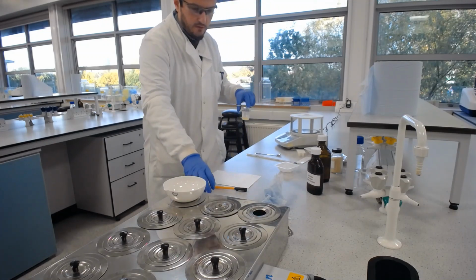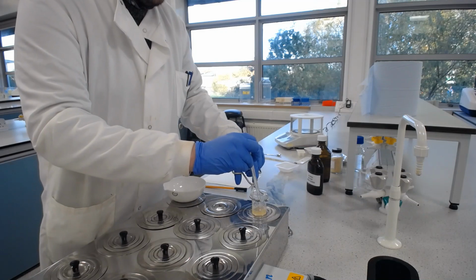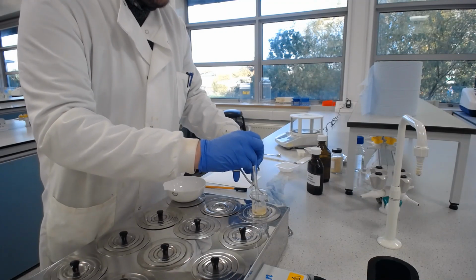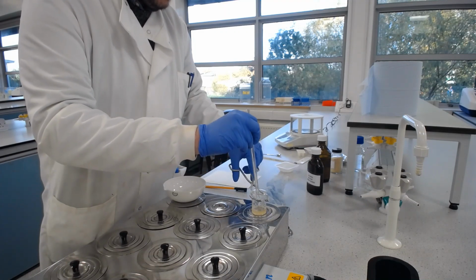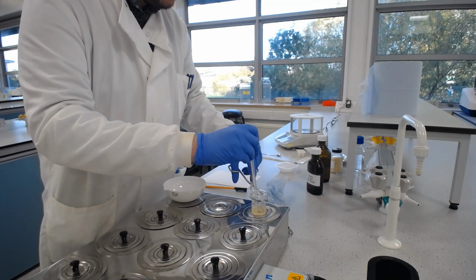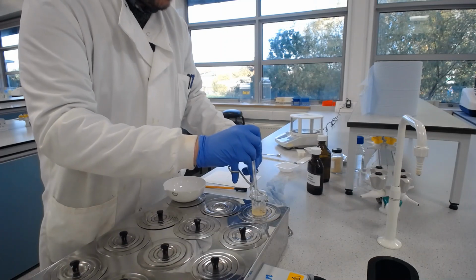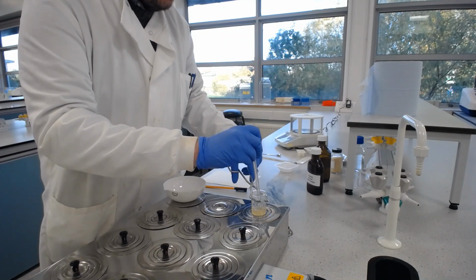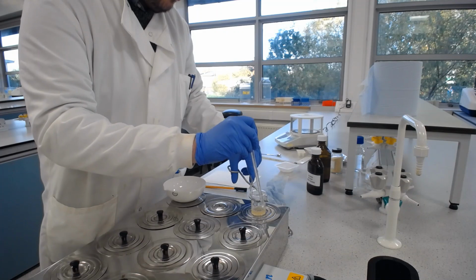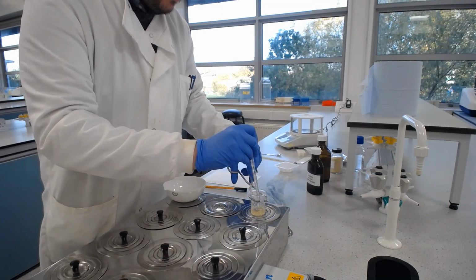So this needs to be going on the water bath for a fairly long period of time. But we do need to keep checking how much we've got throughout that process. And this is just helping also that we're not quite fully suspended or dissolved in.